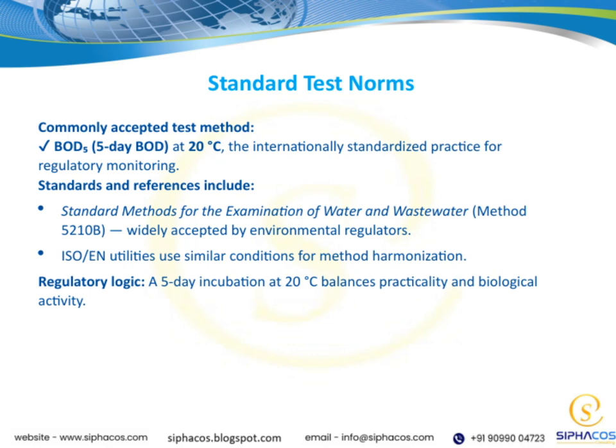Now, from a regulatory standpoint, the choice of a 5-day incubation at 20 degrees Celsius is quite deliberate. It strikes a good balance between practicality, since longer tests can be cumbersome, and biological activity, since this temperature and duration effectively reflect the microbial response to organic matter in water samples. So, in essence, these norms ensure that our testing is both standardized and meaningful, allowing us to reliably monitor and compare water quality across different settings and over time.